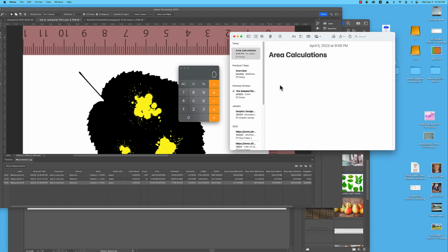All right. So now we want to basically take all of these areas here and add them all up into one gigantic number. I'll do the top one first, so it's 450,132 plus 473,199. We'll just double check. Yep. Okay, hit plus, and then we'll add up the last one.